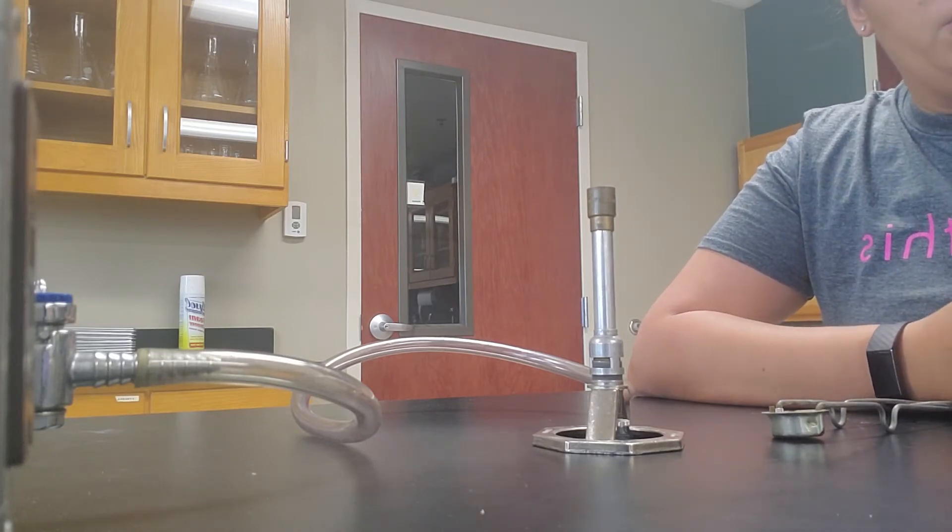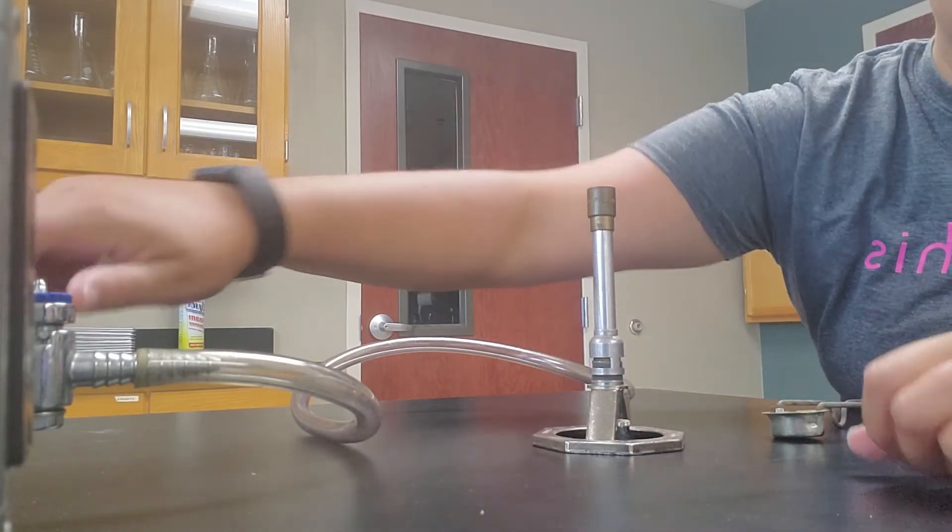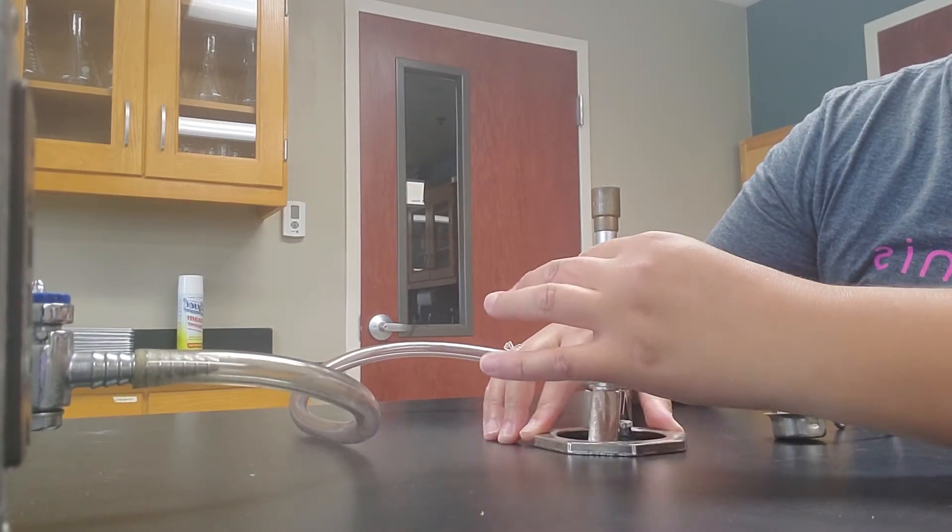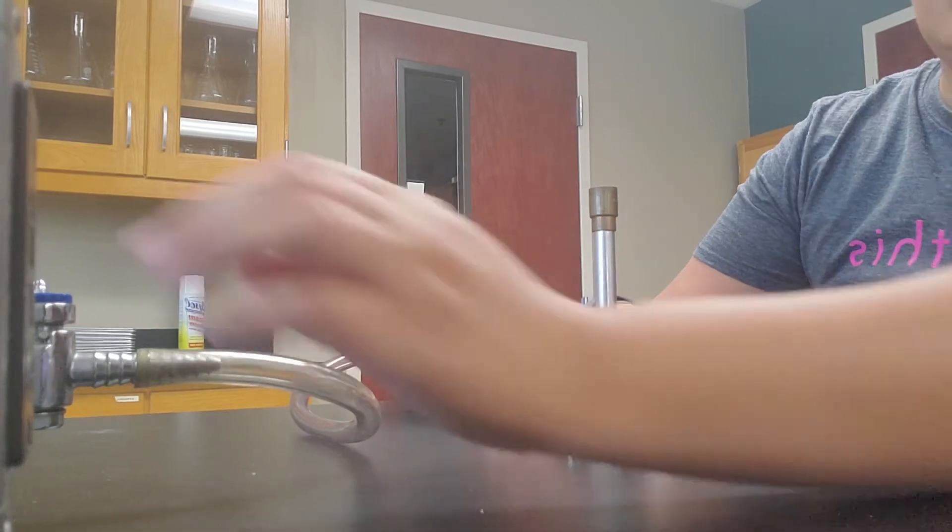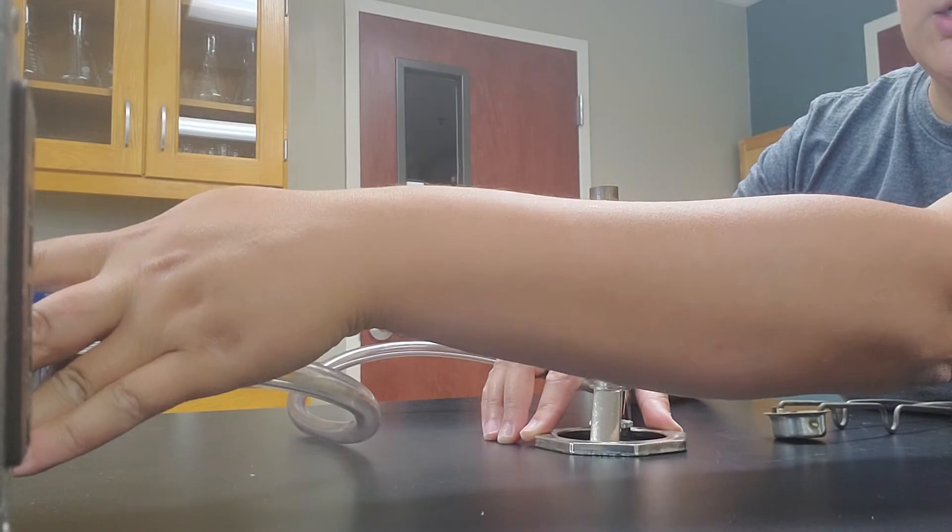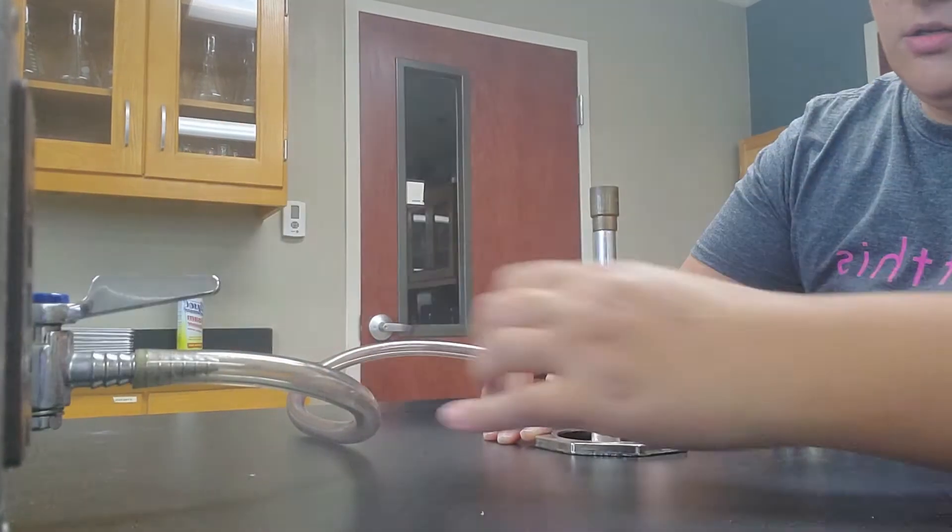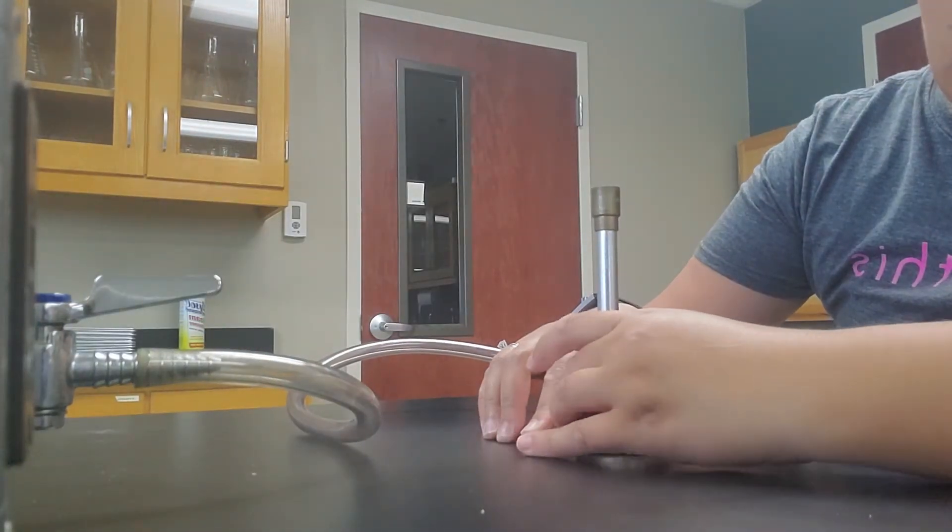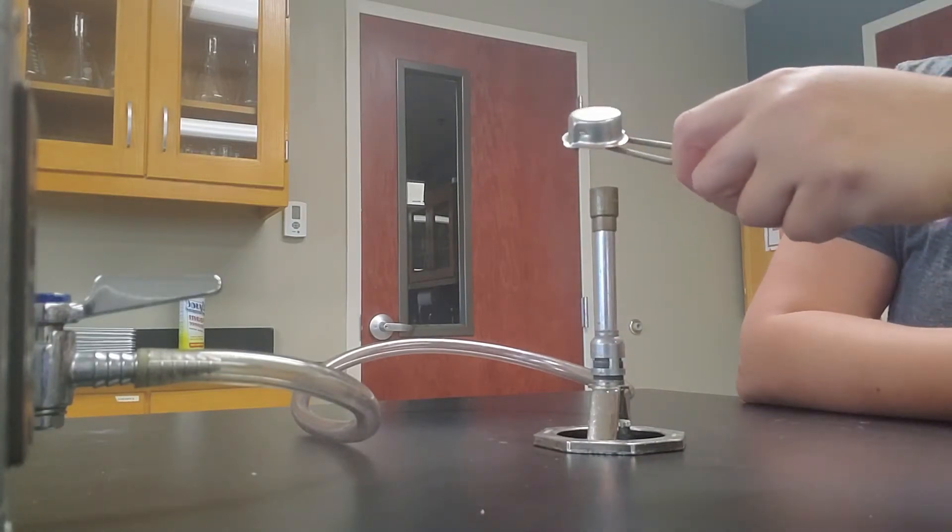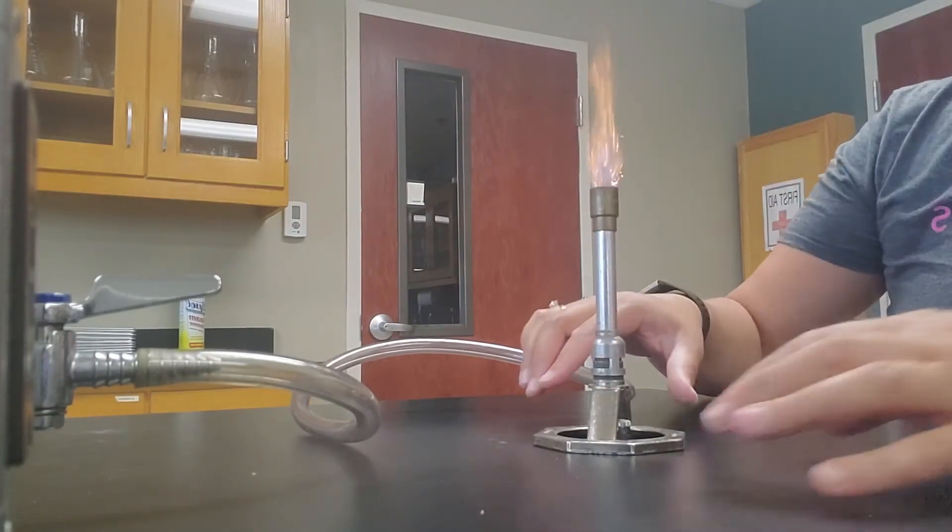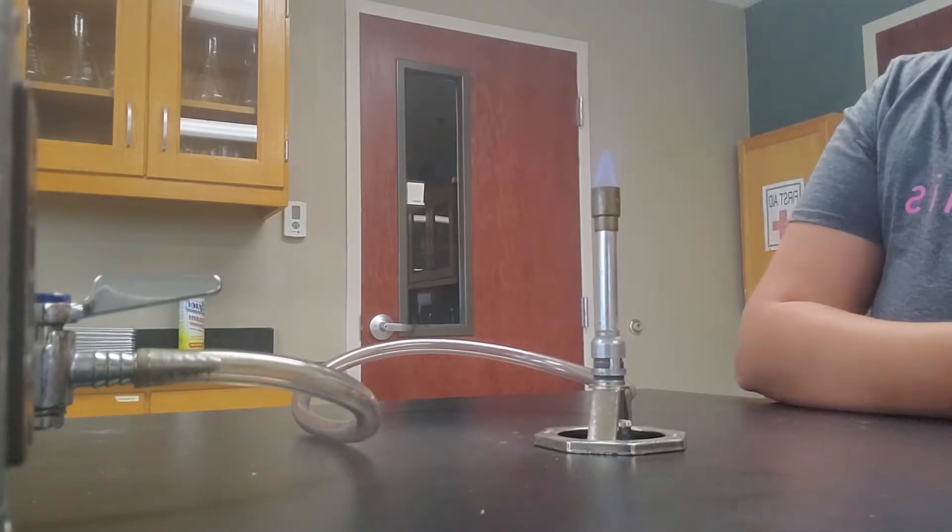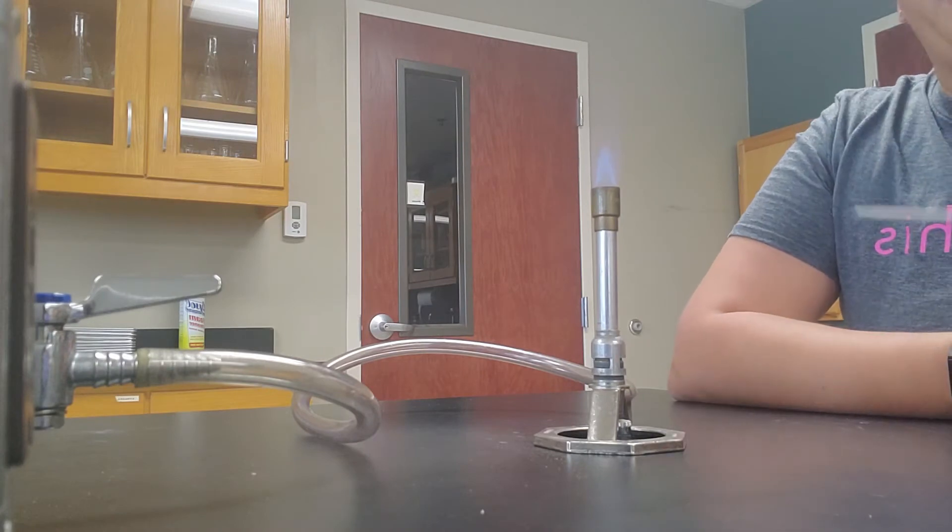So the first thing that you're going to want to do is actually turn on your Bunsen burner. So first thing is, this is going to control gas and air. So you don't want that to be too open, and then you want to turn on the gas itself. You should kind of hear it a little bit. Once you hear it, then you can actually start the flame. So the goal here is to get that pretty blue flame because that's going to be the hottest part of the flame.